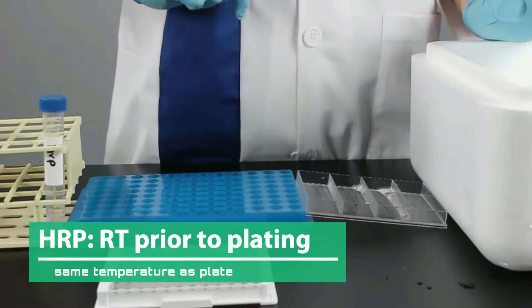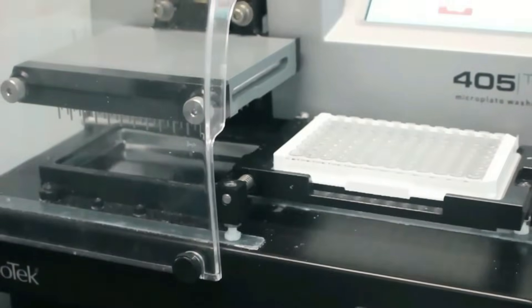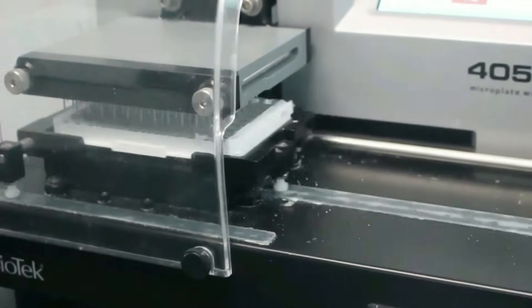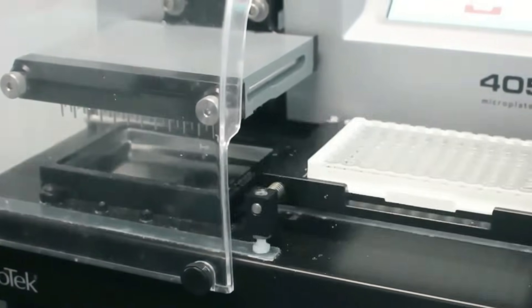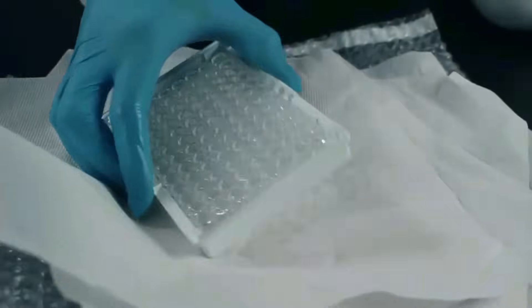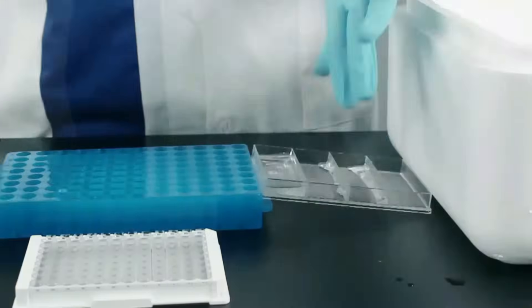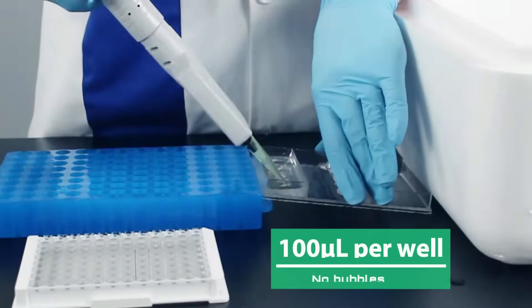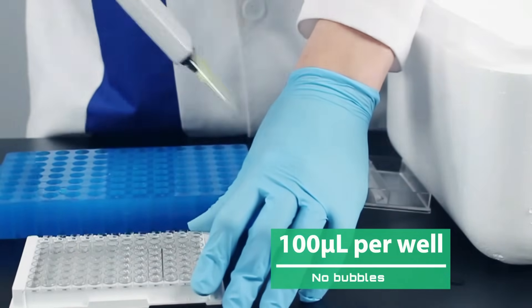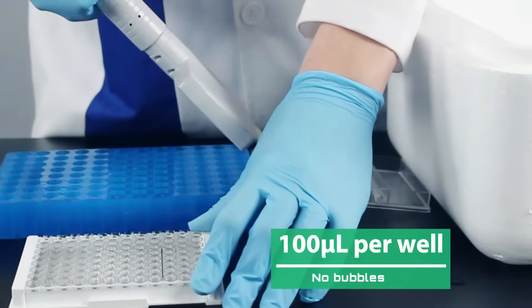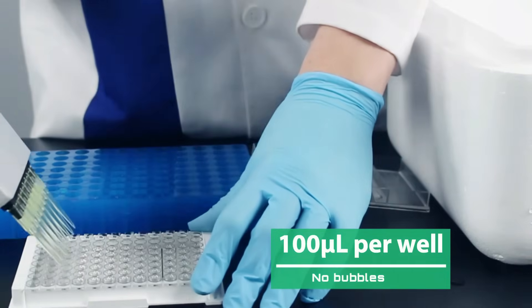HRP should be the same temperature as the plate prior to plating. Once the detection antibody is done incubating, wash the plate again. Make sure you thoroughly remove the wash buffer. Homogenize the mixture with a vortex. Add 100 microliters per well with no bubbles.